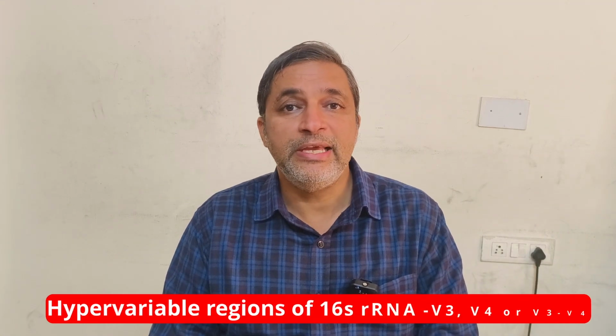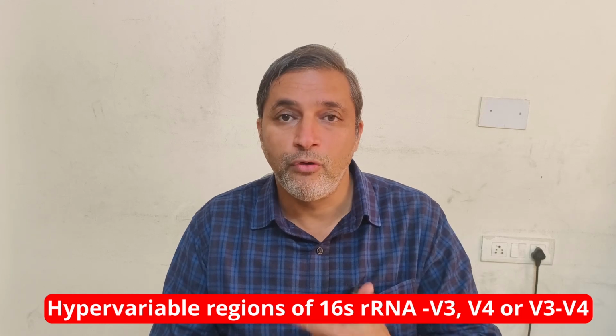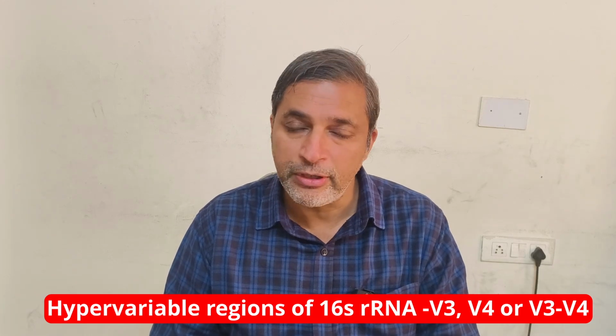These classifiers can be provided by various tools such as Silva, GreenGenes2 or GTDB. Specifically in the case of QIIME2, the reference database classifiers are provided by Silva. So these Silva-based classifiers can match the hypervariable regions such as V3, V4 or a mixture of V3-V4 regions.